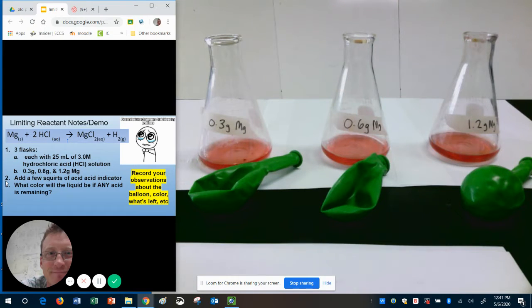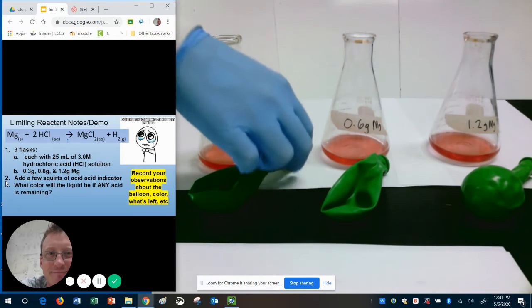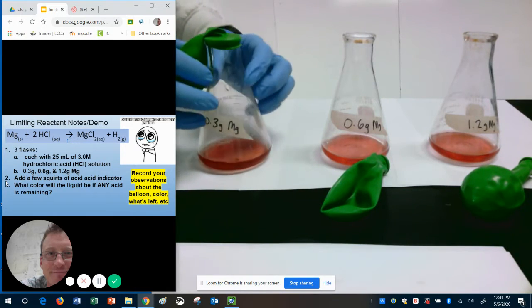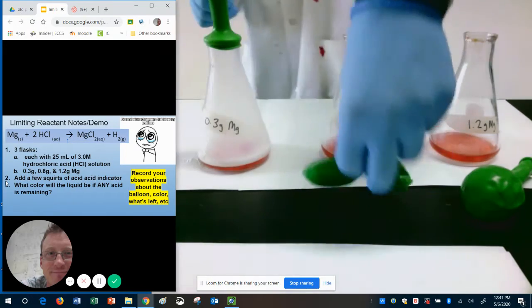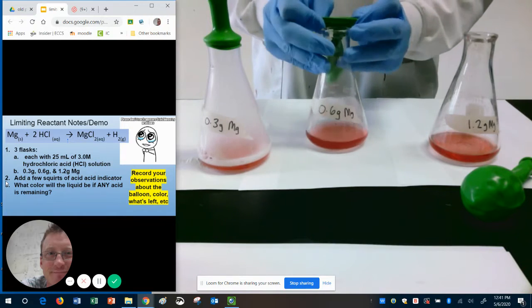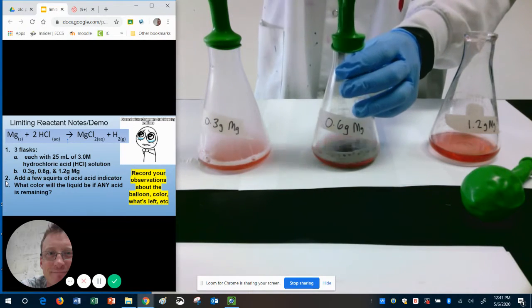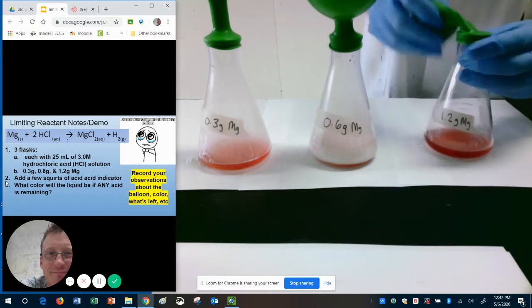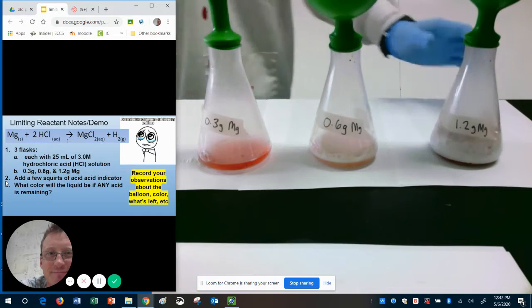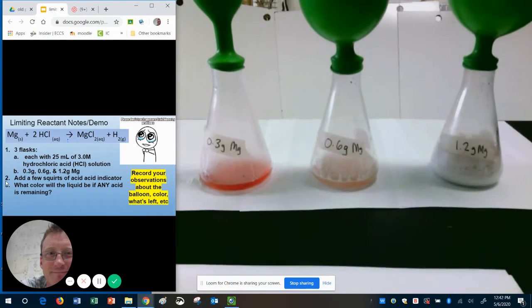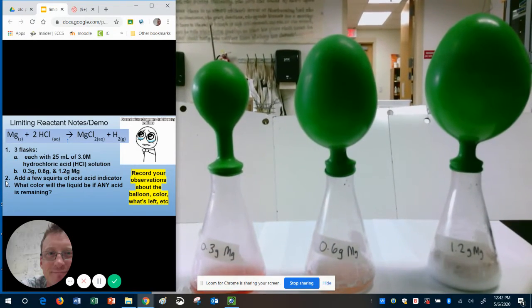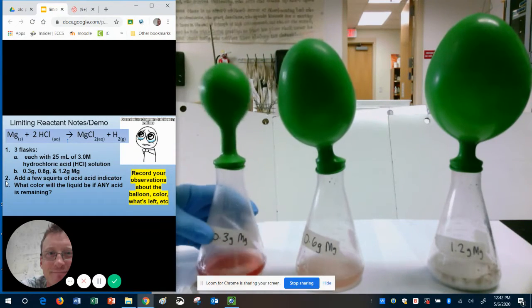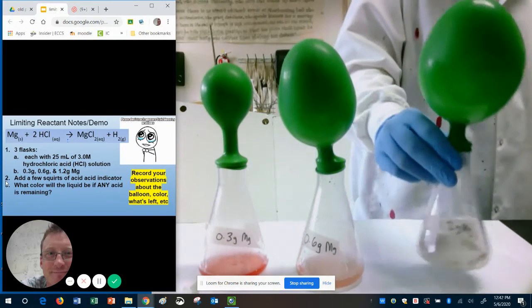Now I already have the magnesium powder in the balloons. I'm using balloons because it'll trap the gas, and it's an easy way for me to add the powder without making a huge mess. Here's the first one. Here's the second one. See, that one's reacting a lot more. It has more magnesium. Keep in mind, all of these have the exact same amount of acid in them. I'm going to move my camera view here.